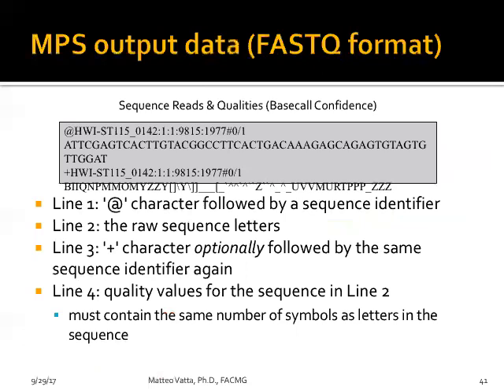Okay, so we have chosen the type of target we want to do, the type of capturing modality, how long the reads have to be, the type of machine, and now we have the sequence. So this is your realm now. So that's the sequence that we usually, yeah.